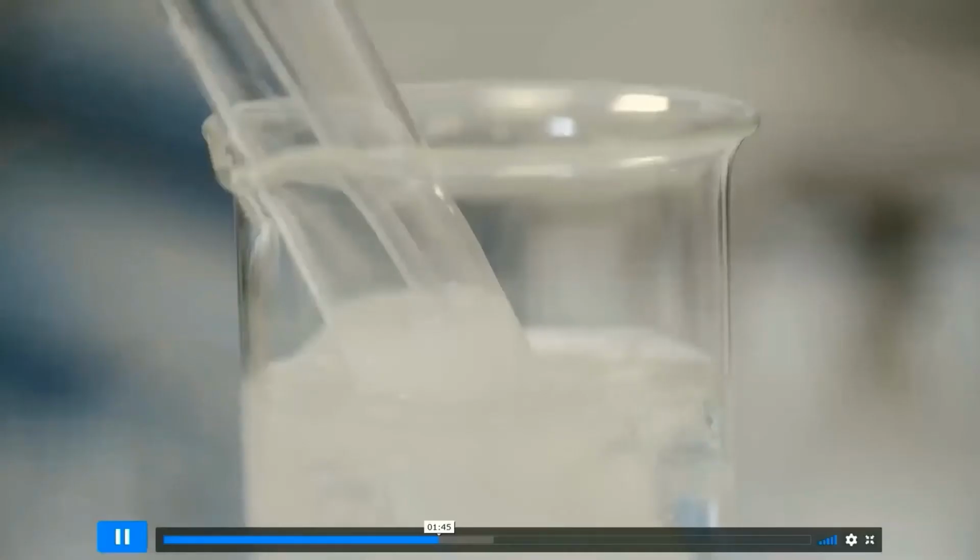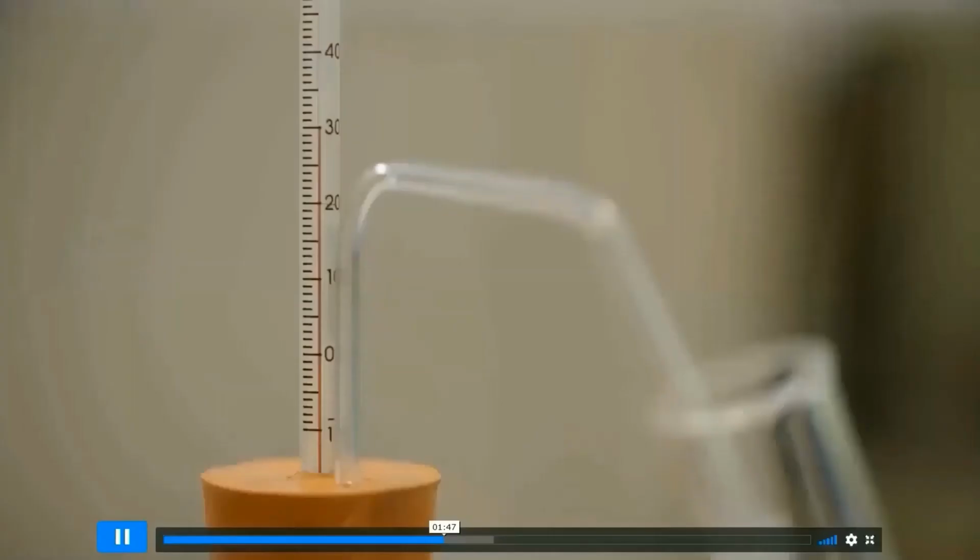The solution becomes cloudy. When the solution becomes cloudy, that confirms that carbon dioxide is reacting with the lime water and turning into calcium carbonate. That confirms the presence of carbon dioxide. Now the temperature is measured and the time recorded. The gas being produced is carbon dioxide. The temperature at which it was given off from the solution was 30 degrees C.